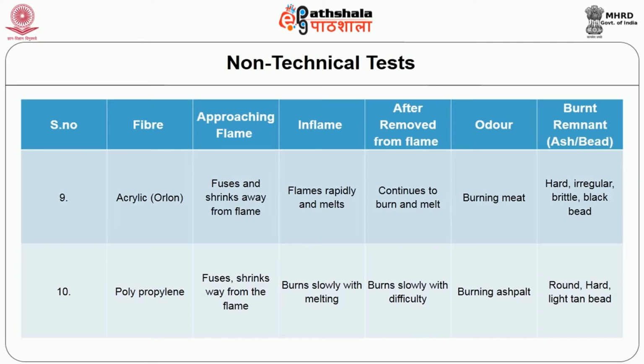Regarding polypropylene, while approaching the flame, it fuses and shrinks away from the flame. In the flame, it burns slowly with melting. While removing from the flame, it burns slowly with difficulty. Regarding odor, it is like burning asphalt. The bead is round, hard, light tan.